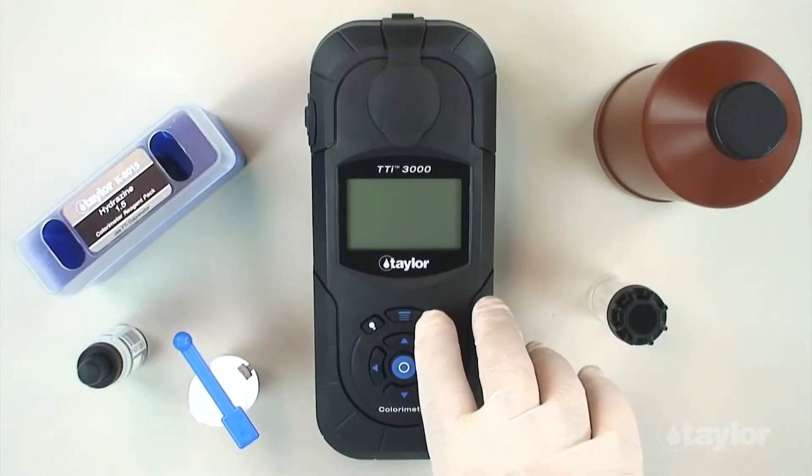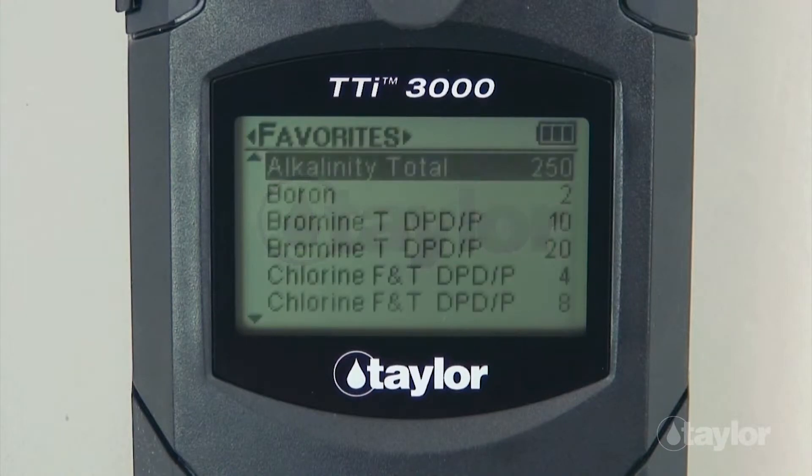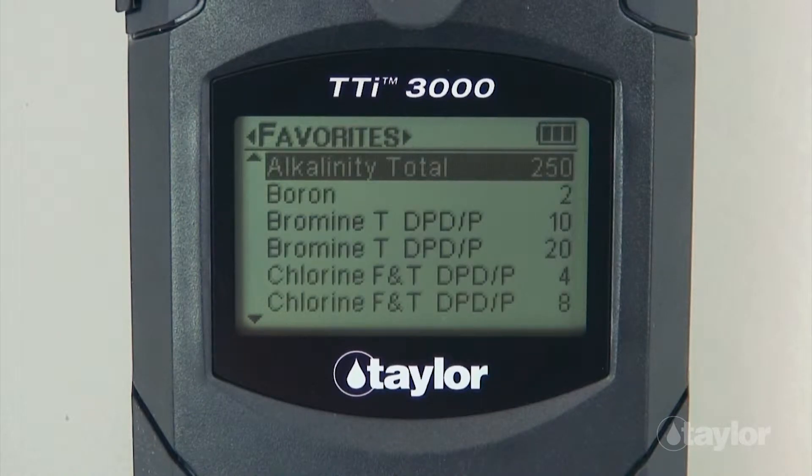To begin, press the Power button to turn on the colorimeter. Press the Main Menu button and select a test menu — All Tests, Recent Tests, or Favorites. For this demonstration, we will select the All Tests menu, which contains a list of the pre-programmed Taylor tests.